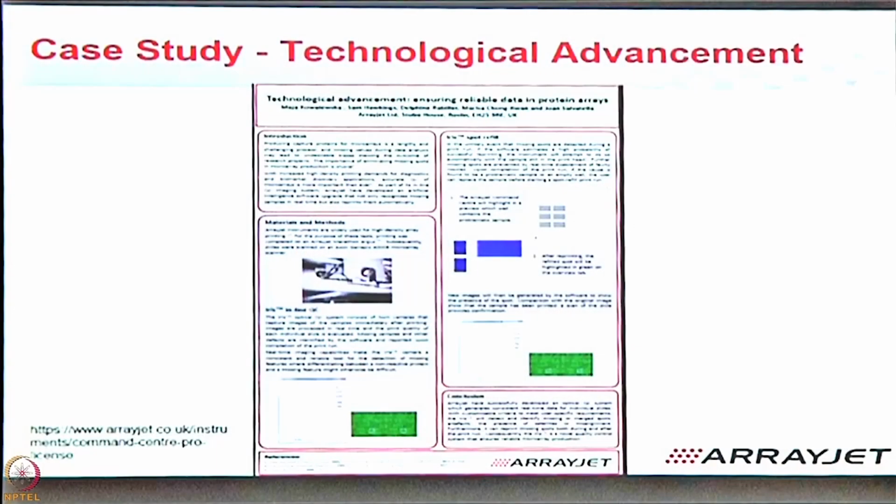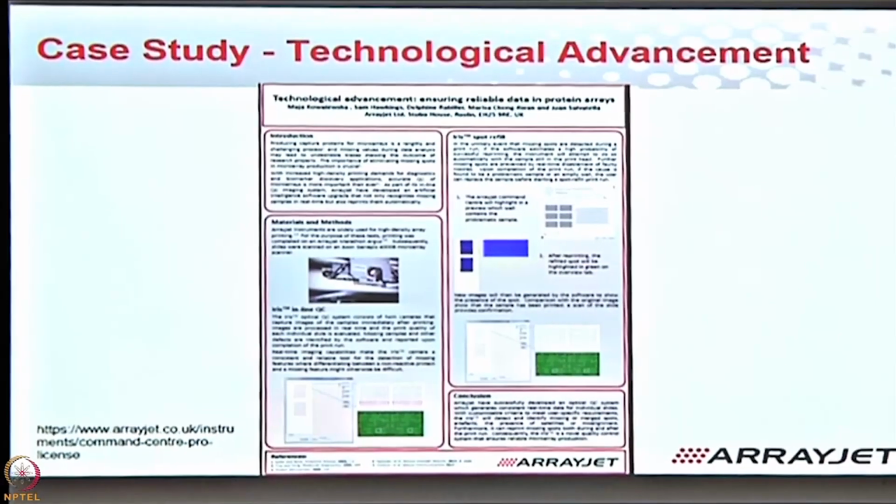If there is anything that you've missed, if there's anything that you've forgotten, mistakes happen. It's okay. So what we are doing is we'll remember that yes, that is the place where she's forgotten these areas, but don't worry, we'll go back, we'll print it. And that's why what comes back at the end of it as a solution is 100% yield. These are some of the case studies that I have put on the table. This is the benefits of reprinting.